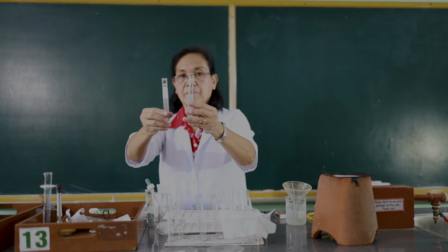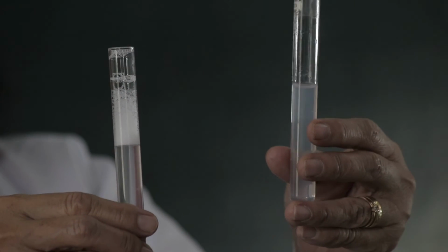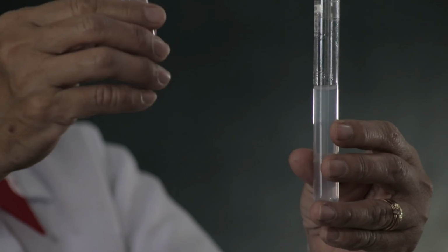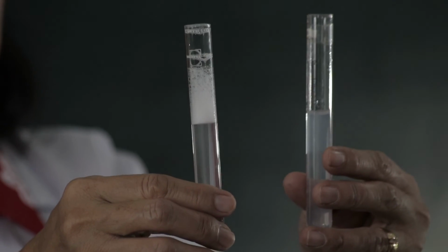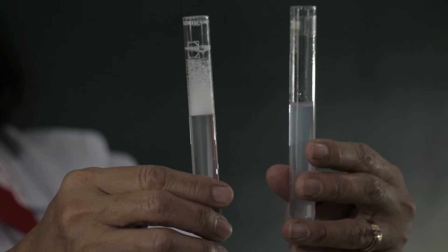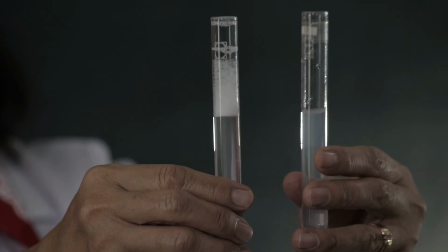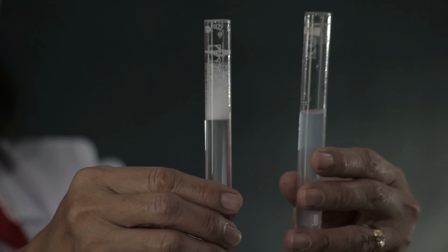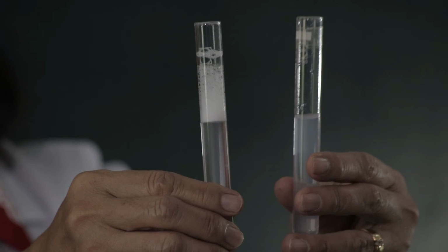Observe. To this test tube containing the distilled water, I added 10 drops of soap solution. To this other test tube containing the distilled water, I added 10 drops of the detergent solution. Observe and compare. Which of the two formed a good lather?